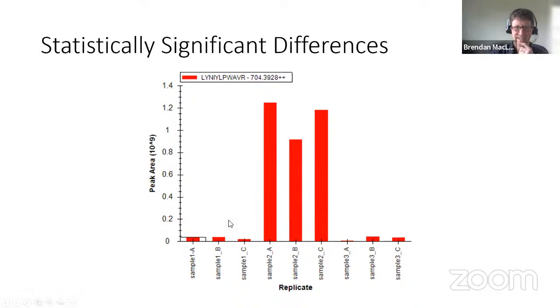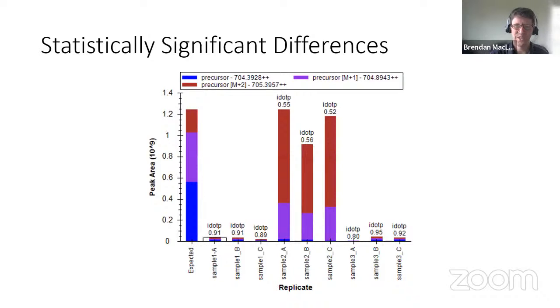And now you can see that we measured in triplicate 3 different samples, and everything still looks fine, right? And now I'd show this, and I would normally ask, well, do you see any indication? We're zooming in through the levels with directed investigation, really easy to do with Skyline. These are just Skyline plots that I've put in slides.